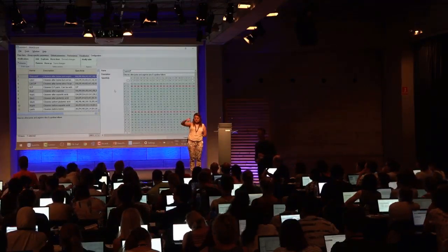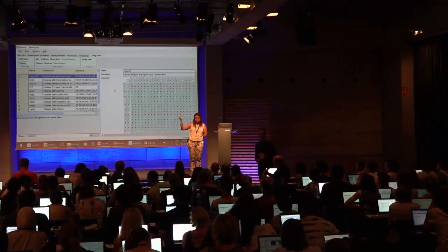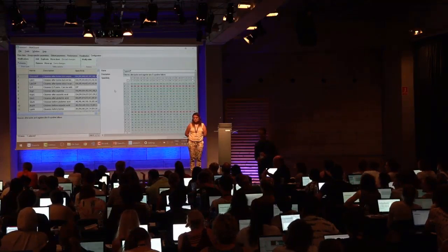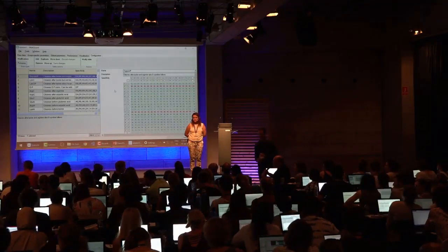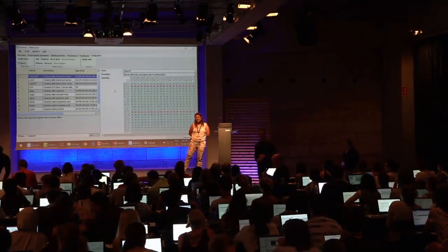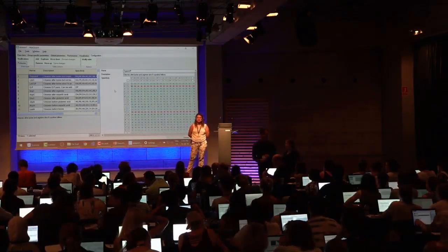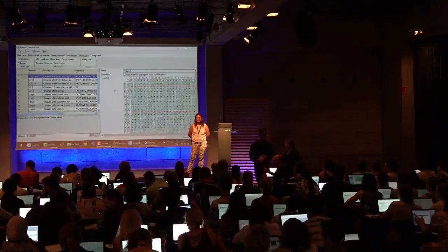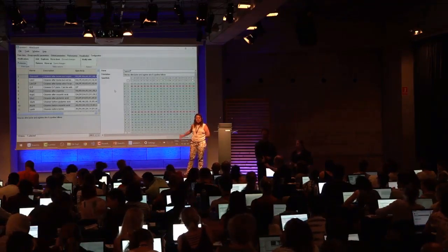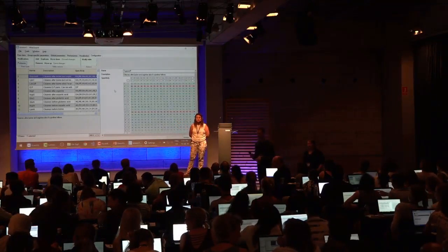But in Mascot it's an underscore, no? The default is not like a slash, because here we have a slash. Yeah, okay, then maybe we can agree that the nomenclature in Mascot and MaxQuant is different. But then, is there a right or wrong in the nomenclature? I don't think so. It's just how it's called, basically. But if you are not happy, you are free to configure Andromeda, so you can change this for your settings.